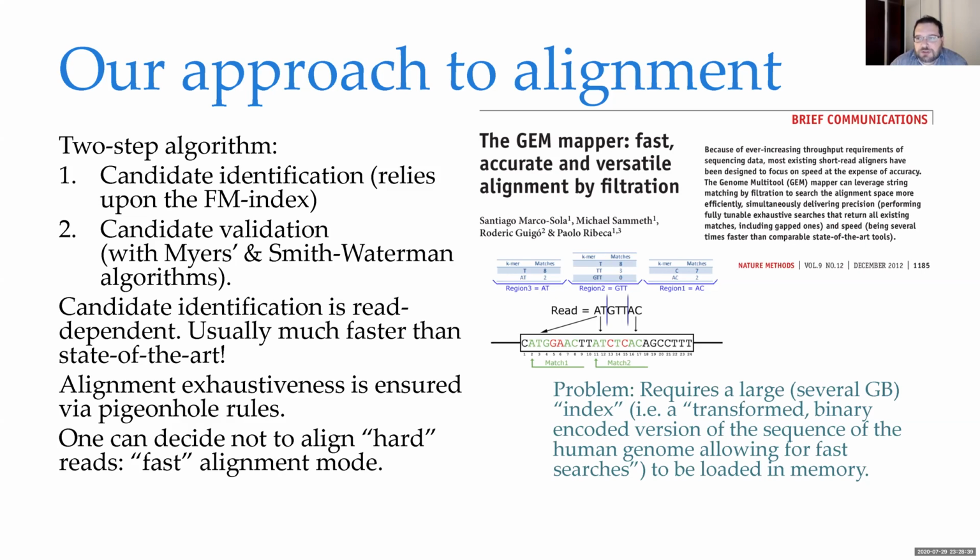What is interesting, though, is that this stage is implemented as probably several tens of thousands of lines of C code. So it's a very complex piece of software, optimized for multi-threading, to be run on a server node, a cluster node. It is also optimized for reading and writing so that it can provide a suitable throughput to process a lot of sequencing reads in a short amount of time.